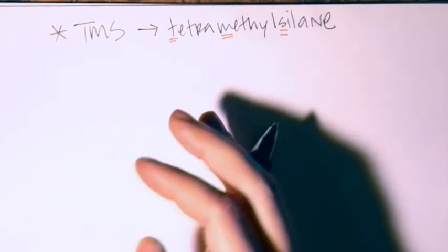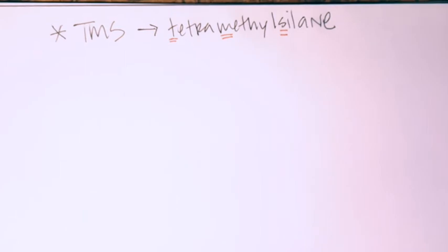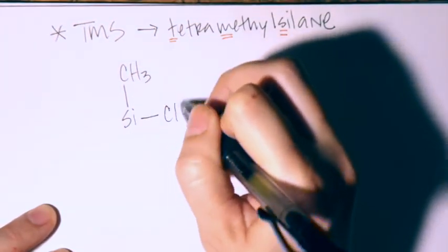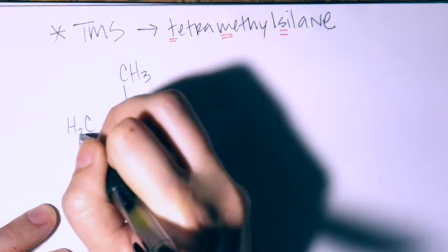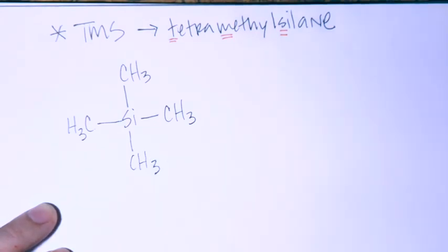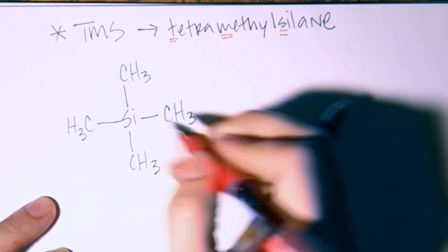Because when you stick these samples in the NMR, the NMR spectrum is on a scale of ppm, but the spectrometer itself doesn't know where to set the 0 point. So it might give you all the peaks you're expecting to see, but it doesn't know what number to put them on because it has no idea what they are. It just knows where they are relative to each other. So in order to get the computer and the spectrometer to orient where the numbers should go, we add this compound to our solution and use it as an orientation point because it has a known ppm. And then we can tell the computer this one should be here, and then it orients everything else.